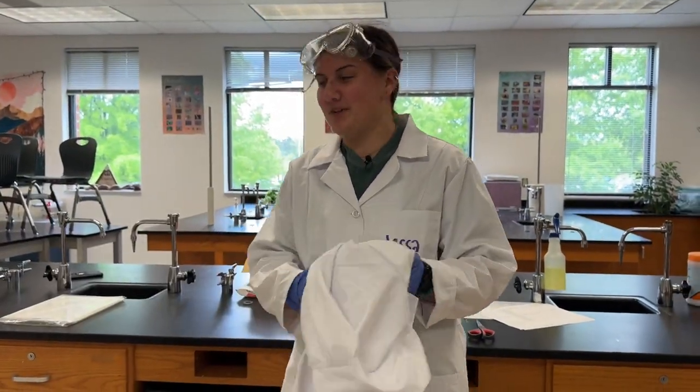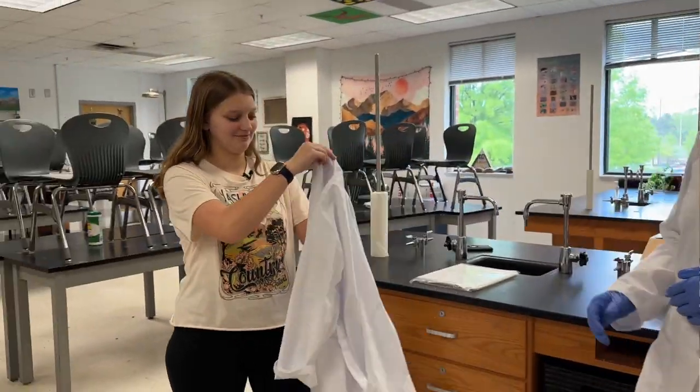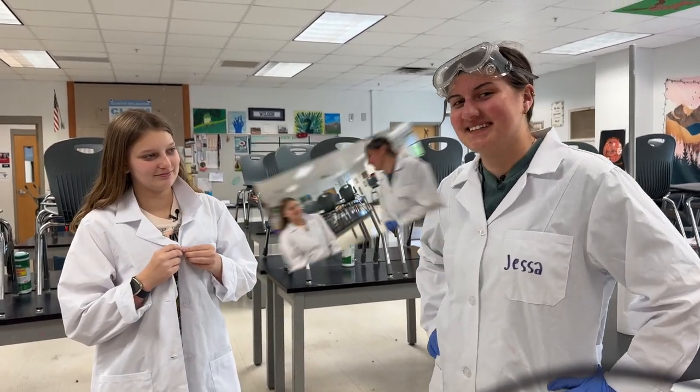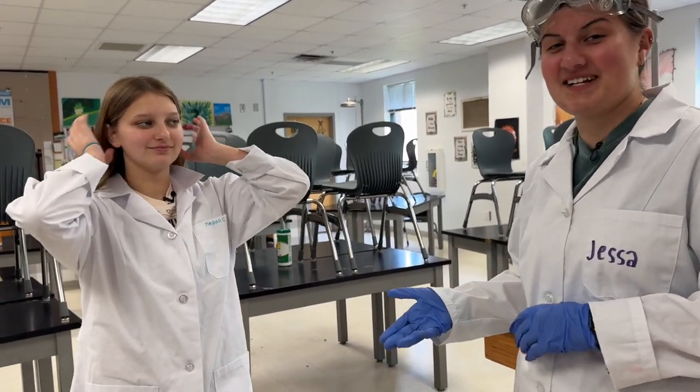First, you have to put on this lab coat. Do I have to button it? Of course. We're all about sterile technique. And don't forget to keep your hair out of the way, so it doesn't catch on fire.